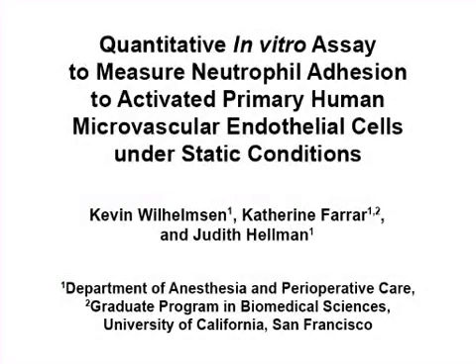The overall goal of this procedure is to determine the extent of microvascular endothelial cell inflammatory activation by quantitating the relative number of neutrophils that adhere to the endothelial cells in vitro under static conditions.